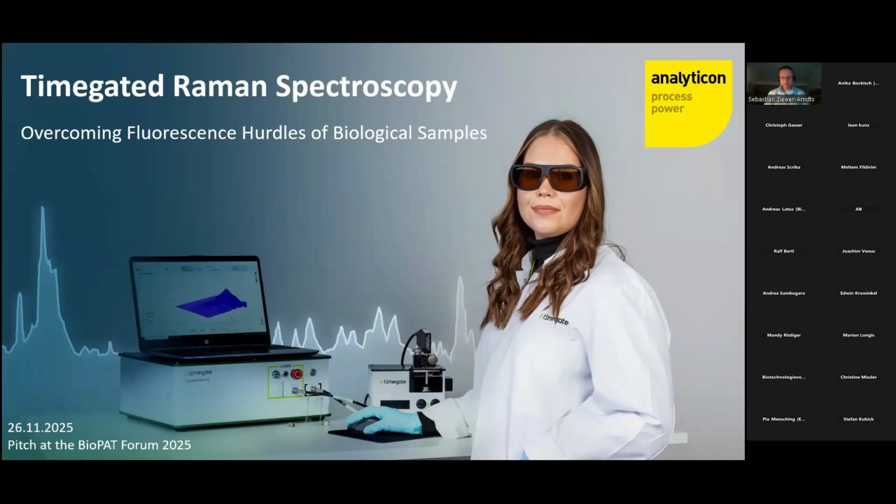I'd like to talk about time-gated Raman spectroscopy, a cool tool for overcoming fluorescence hurdles of biological samples.